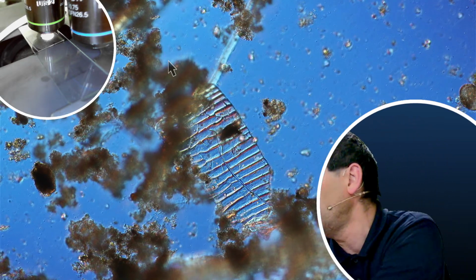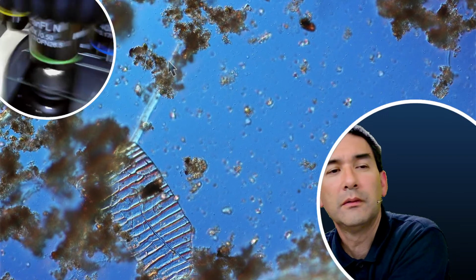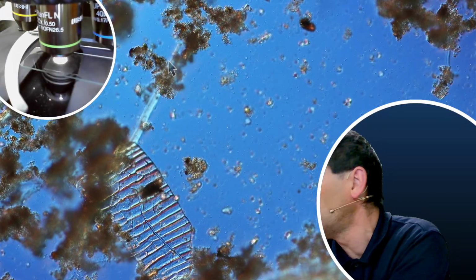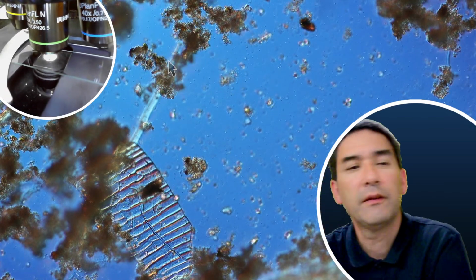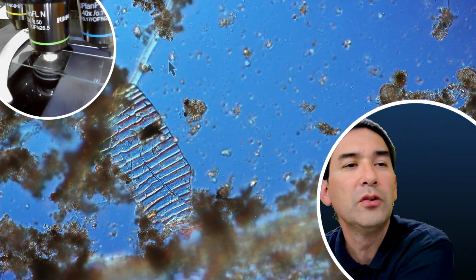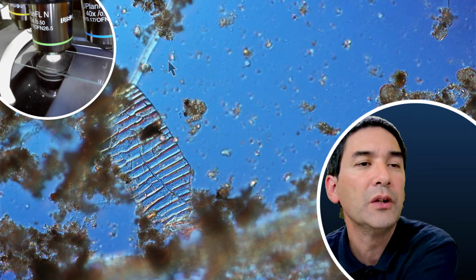You may want to adjust the camera angle of the microscope lens. Thank you for reminding me. Okay. It's in a very unfortunate position here, because I've got the microscope controls right next to it. And I do have a possibility to focus it as well. I have to turn it manually.